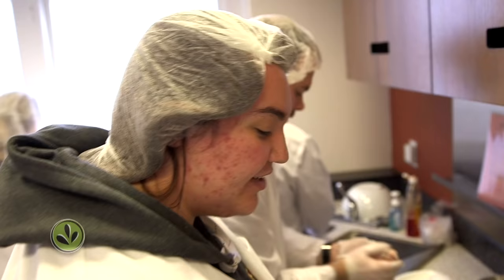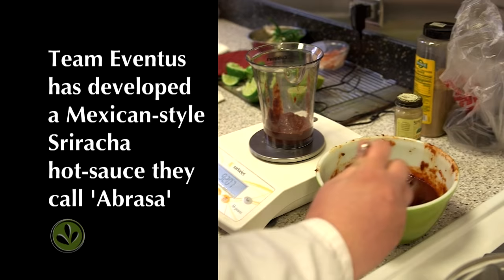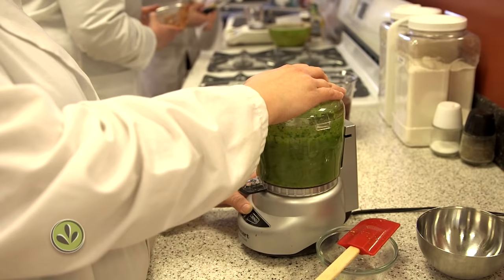I'm weighing out 350 grams of our chipotle pepper and adobo base — that's the pepper base for our chipotle Mexican-style hot sauce. The poblano adds a little bit of heat, but it actually tones down that chipotle flavor and the overwhelming spice into a more warm and interesting flavor instead of being overpowering.